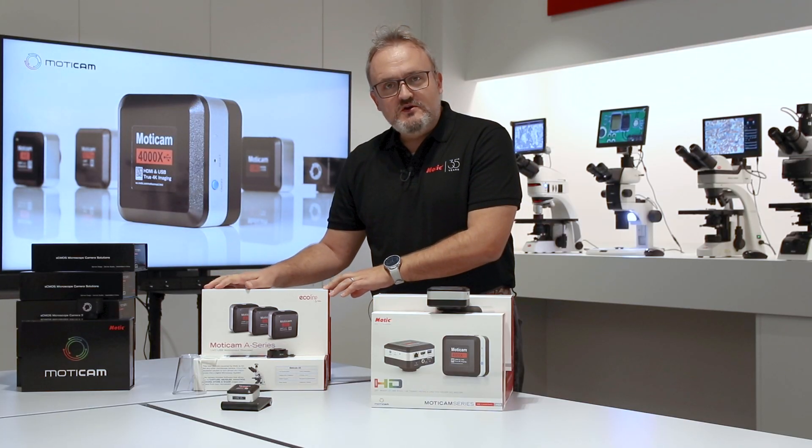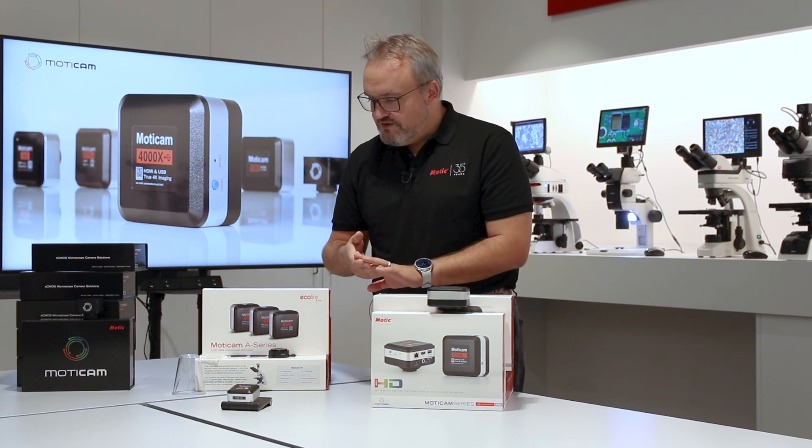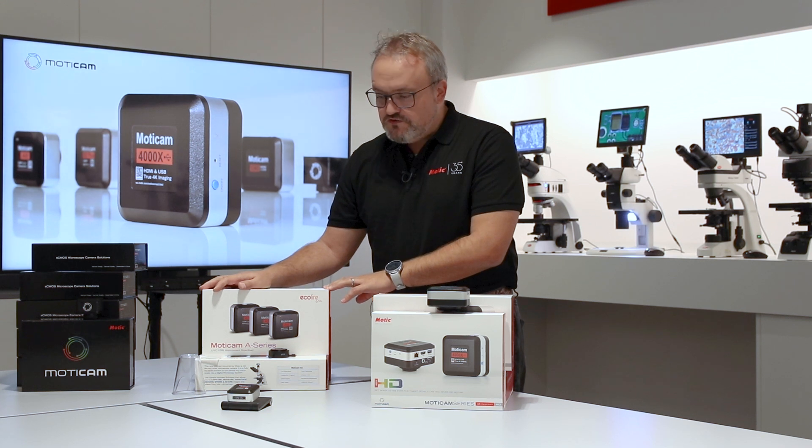It comes with its own small application software, Moticonnect, which can capture, annotate, capture videos, and measure — so you can really quantify the image.